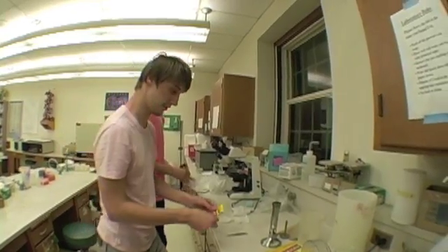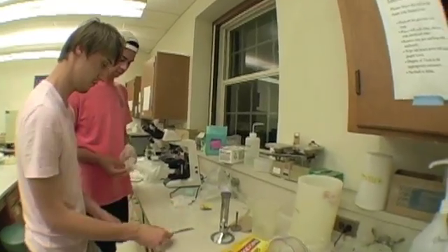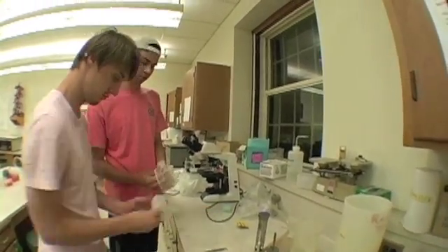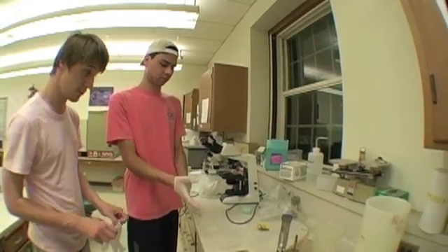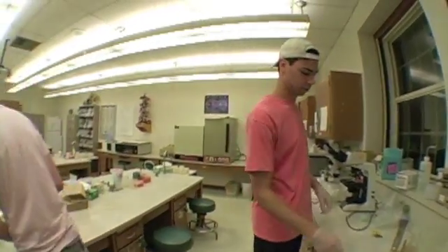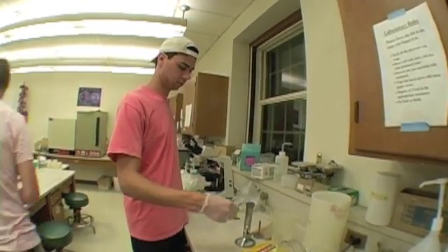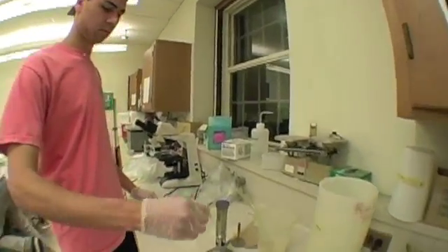First, begin lighting the Bunsen burner with your matches. Then put on your gloves. After you have put on your gloves, grab your glass rod with your forceps and begin to heat.